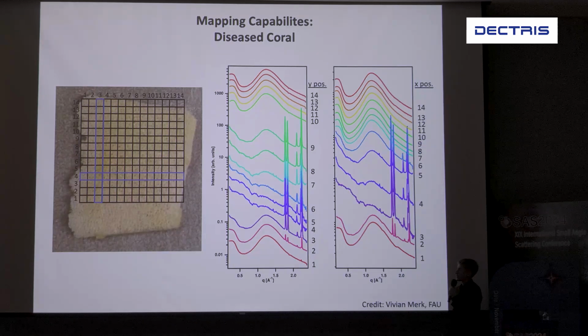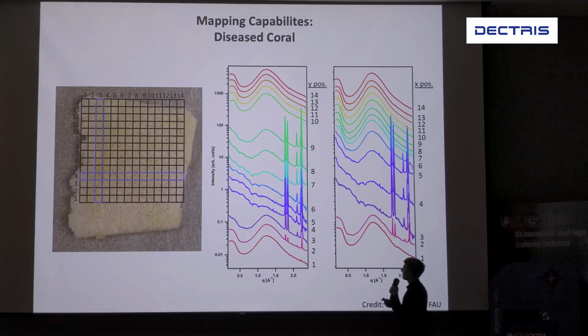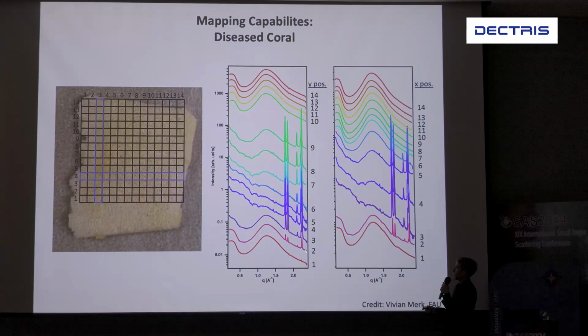So some other samples that I've run in the last couple of months is mapping of diseased coral. Because of the increased flux, we're able to cut down the beam size. So I set the beam size down to about 150 microns here, and then just went in an array through the entire thing. Now granted, this was about 10 minutes each spot, and I did SAXS and WAXS, so it took about 2 days to finish, but it was done, and you can see clearly, it's a little hard to see, but this yellowish color diseased area is where the calcification is occurring, and the healthier regions are this amorphous part of the coral.